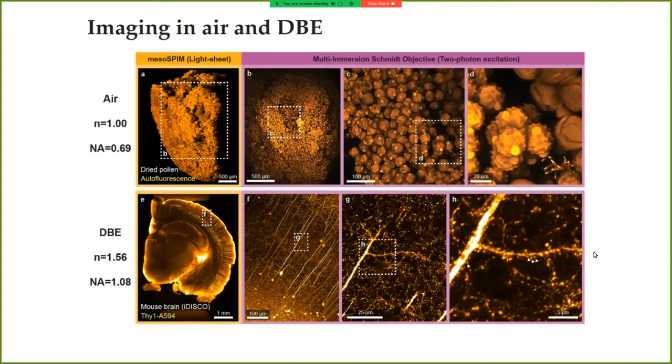But however, unlike a normal air objective, we can now fill it with an index matching medium, for instance, dibenzyl ether, as used in the iDISCO protocol, and then we can take a cleared sample, in this case a mouse brain processed using iDISCO, and immersed in DBE at an index of 1.56, and image individual neurons like this layer 5 pyramidal neuron in the mouse cortex. And if we zoom in and in, we see at some point we're at a resolution level where we can easily resolve individual spines, which are the postsynaptic compartment that is receiving information from other parts of the brain in this case. Now, for me, it was one of the really amazing things about this project that using this very simplistic objective, which only contains three optical surfaces, recall there's two surfaces in the correction plate and one spherical mirror, in order to achieve an imaging quality like this, where again, you wouldn't be able to tell it was generated using a home-built microscope objective.